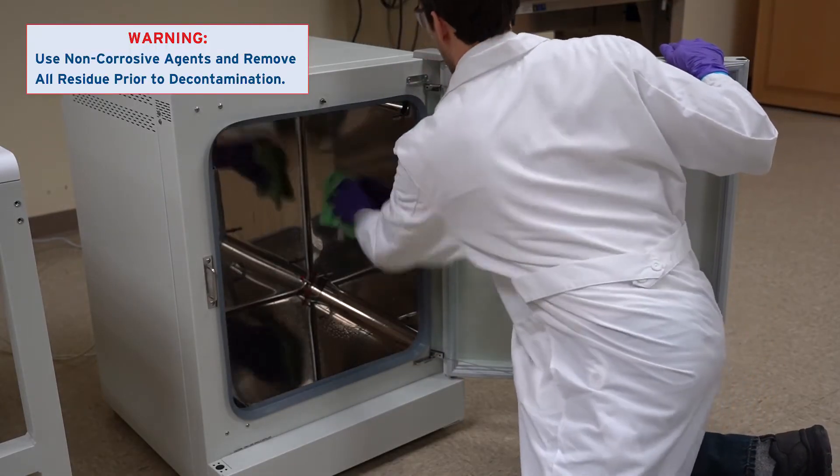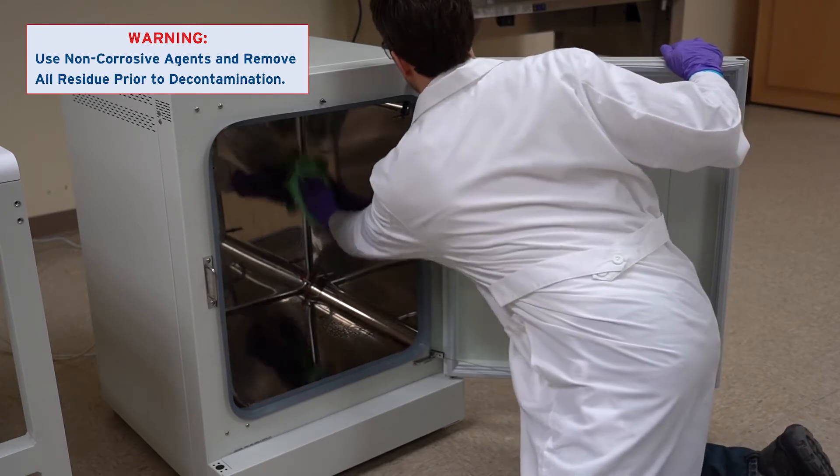Be sure to use non-corrosive cleaning agents and remove all moisture and residue when done cleaning.